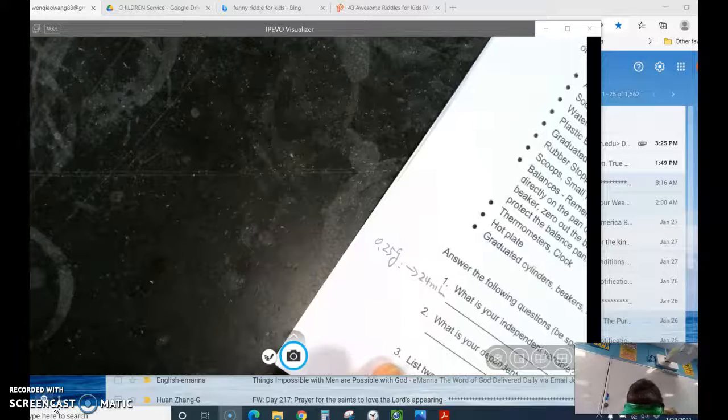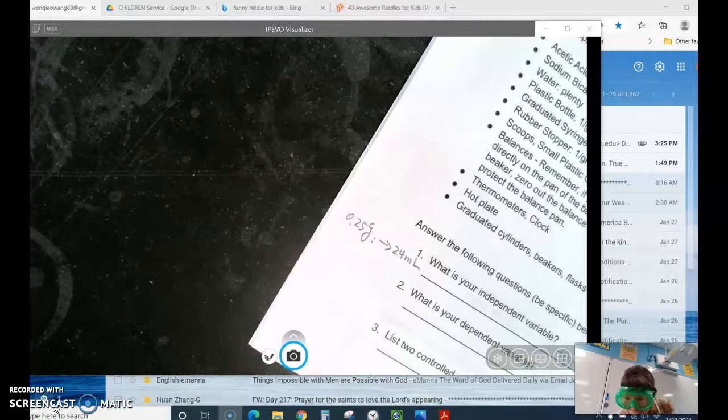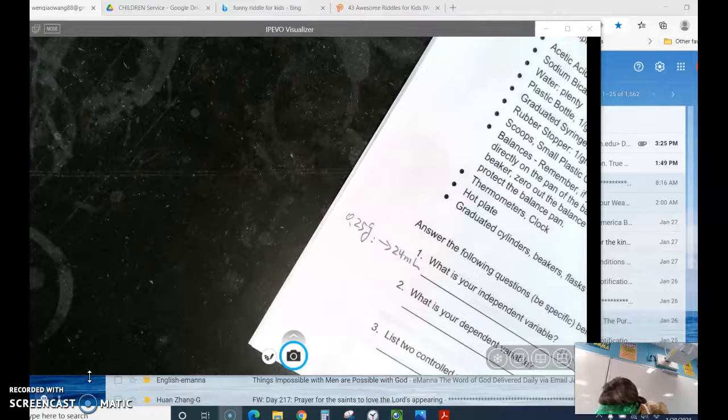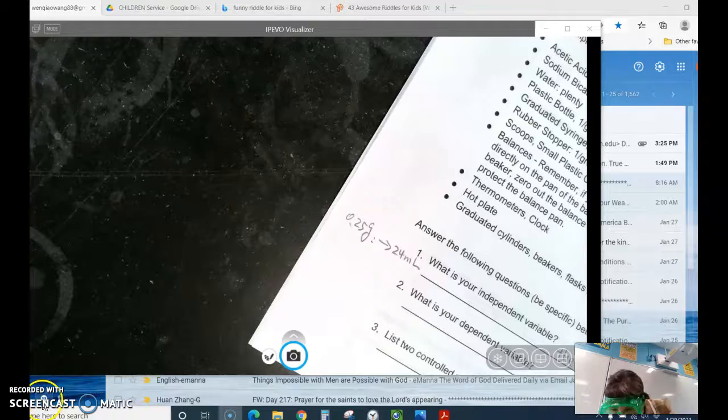Okay, so I got to speed up a little bit to see where my recording is. Okay, so guys, I'm going to stop here because my recording would not be long enough. So I finished this one, and then I started to record the second one. The second one would be faster because you know the process. I just changed the gram, how many of them, okay? So I'm going to stop.